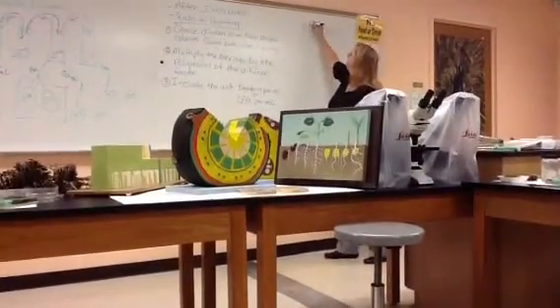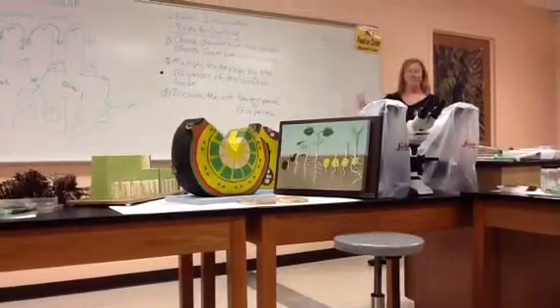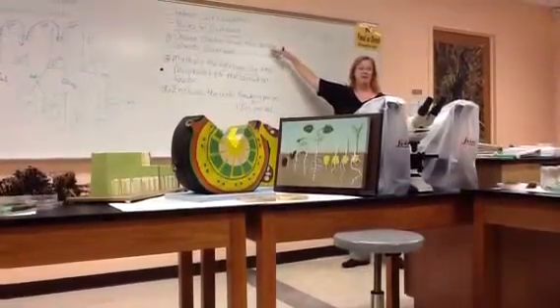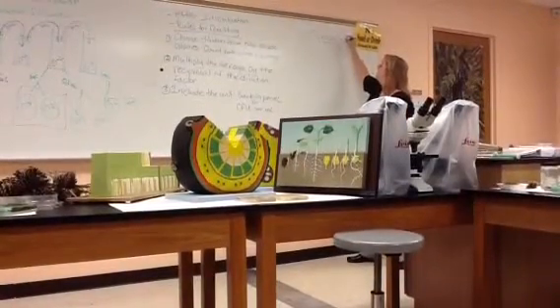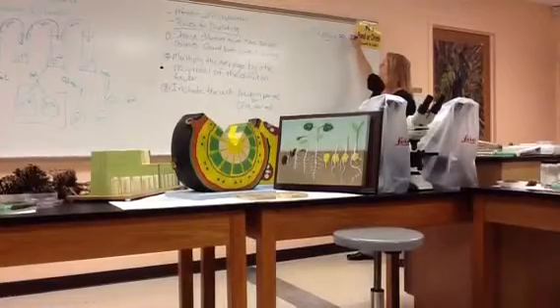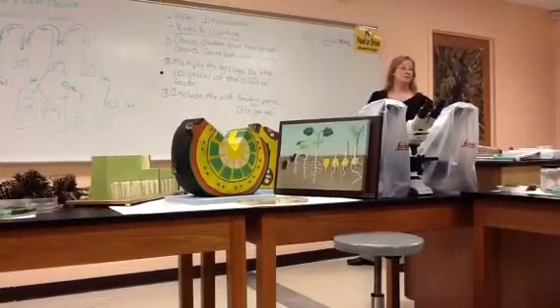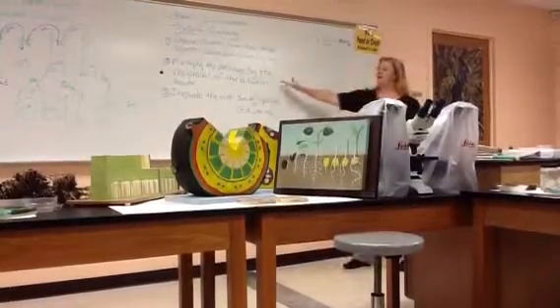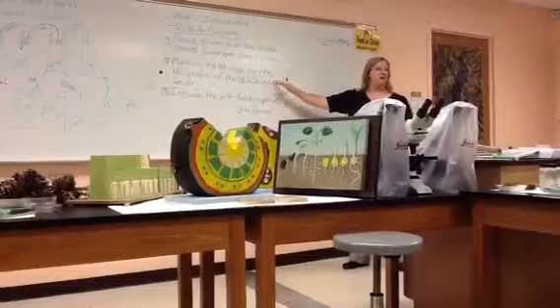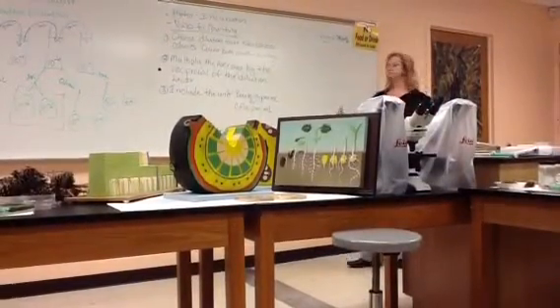Minus 8 dilution. A student in lab did a viable plate count for the -8 dilution, which looked like it had between 30 and 300 colonies, and you found an average of 78 bacteria per mil in the 10 to the -8 dilution. So you're going to multiply that average by the reciprocal of the dilution factor. What's the dilution factor? Fraction form.